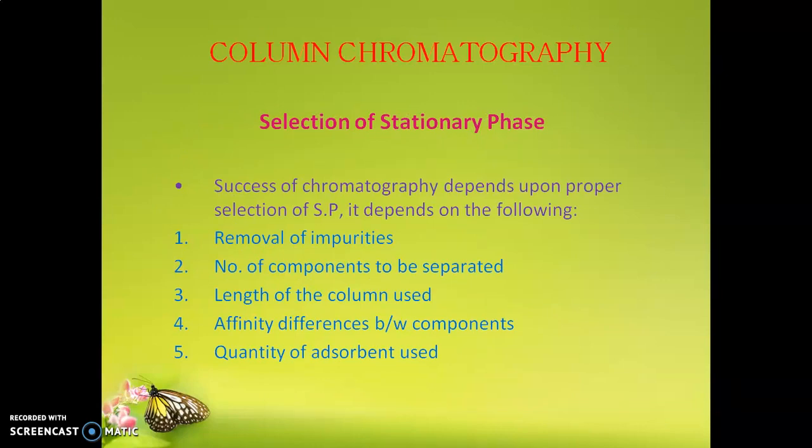Then how to select the stationary phase? Selection of the stationary phase is very important, as success of chromatography depends upon proper selection of the stationary phase. So the selection depends on some factors, such as removal of impurity from the stationary phase.